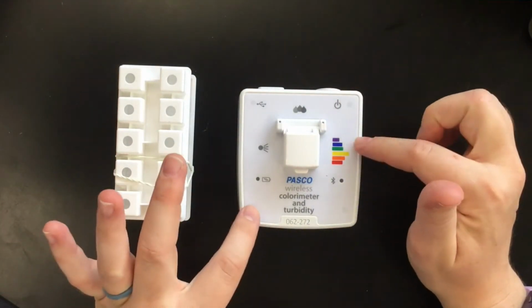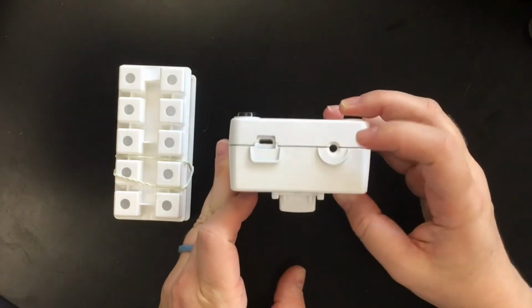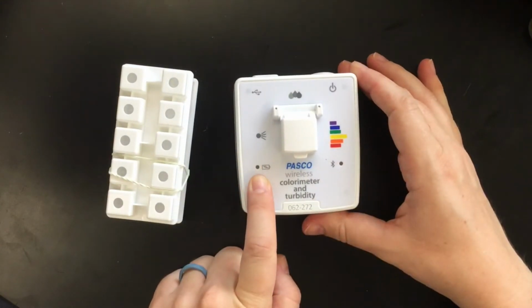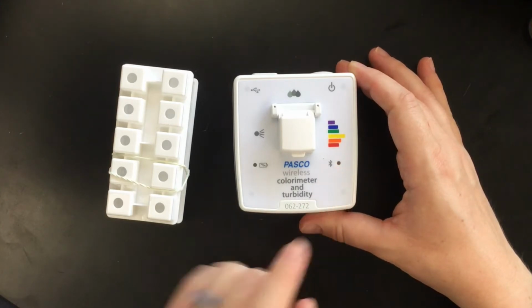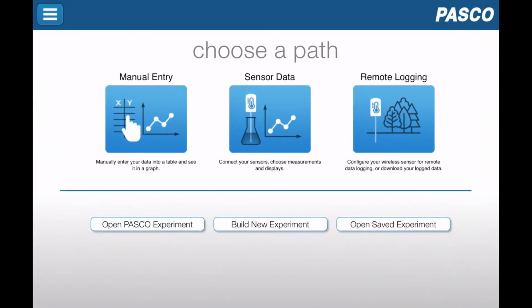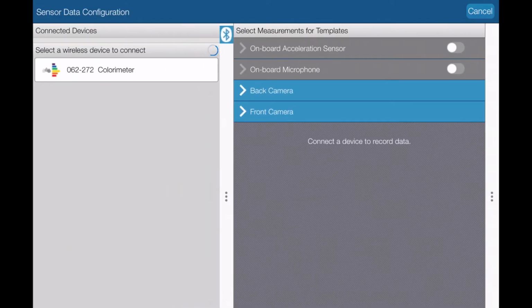To connect your colorimeter to your iPad, you'll first need to turn it on, and the power button is in the back. You just press it, and it'll blink red first, and then the wireless Bluetooth will start blinking as well, and that's how you know that it's on. Next, you'll need to open the SparkView app. To use your colorimeter, you're going to click on Sensor Data, and then click the Bluetooth on the side in the left, and your colorimeter should come up.